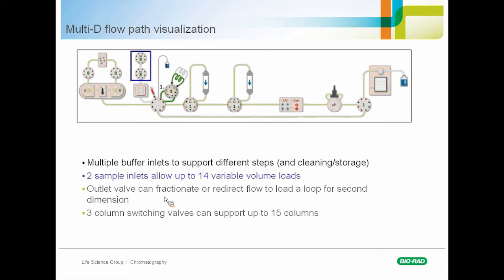So this first step was a tandem step where we eluted from the protein A and sent it directly into the P6 column. So that's why we have the peak missing from the protein A elution. What we then do see is the peak from the desalting column. So this went straight from protein A to P6. After going through the desalting column, it went to the detector, which gives us a signal.